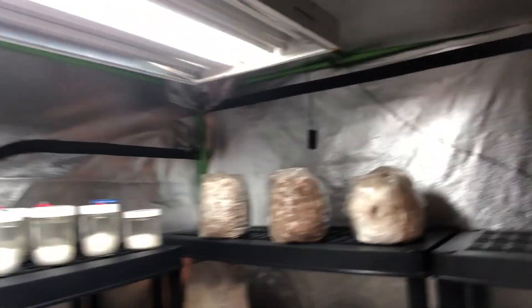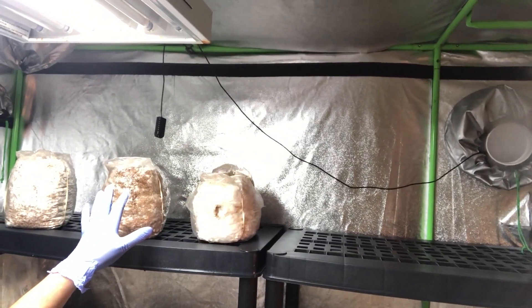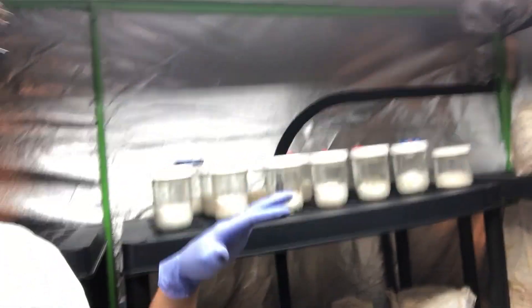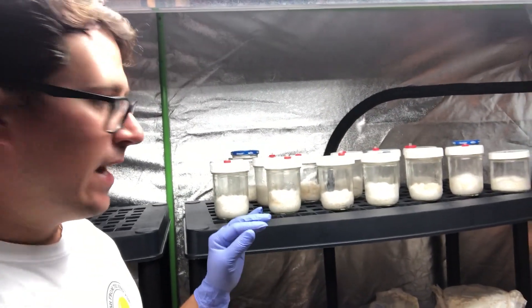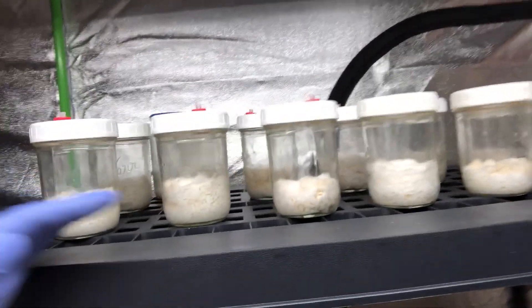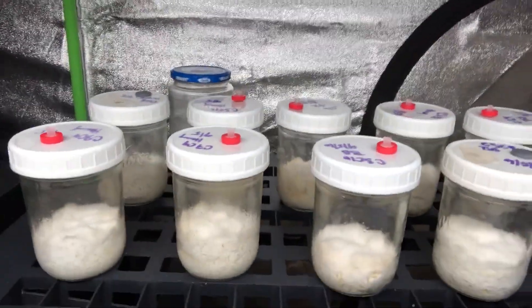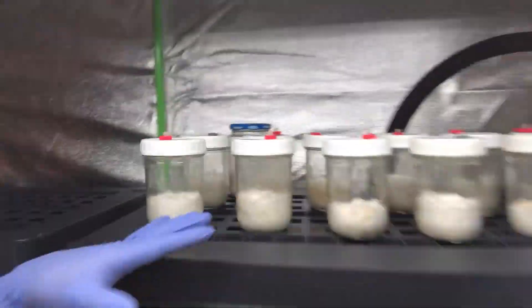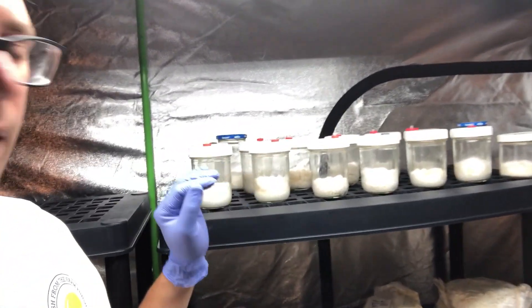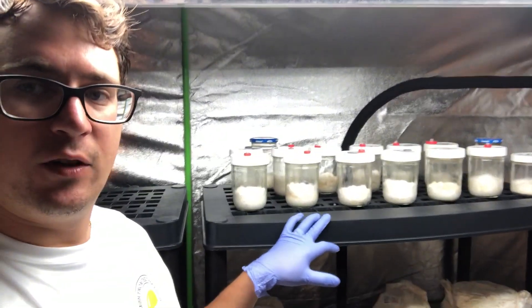I've got my fresh air exchange coming in right here, and this is my humidifier detector. I've got my humidity at about 92% right now. You can see these are all the different crosses with TSB and honey liquid cultures. I'm going to set up some kind of camera to monitor the growth over the next few weeks.